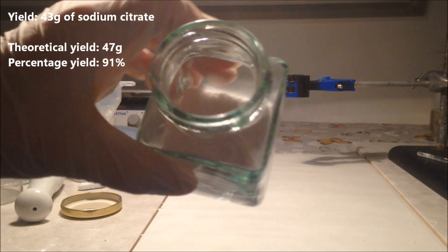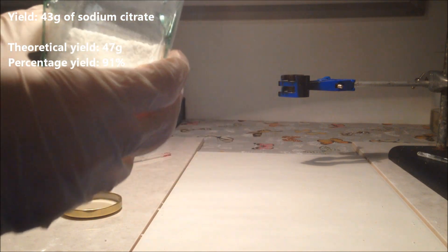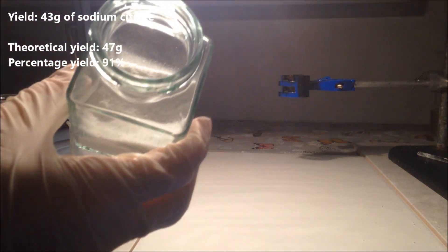I eventually got 43 grams of near powder sodium citrate, which shows about a percent yield of 91%, which is all right. I can see lots of ways I could have improved, but ultimately I'm quite happy with that percentage yield.